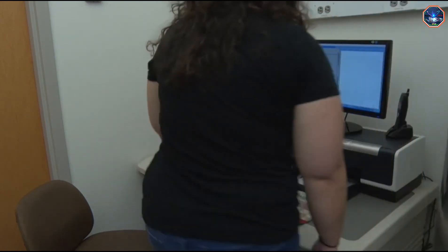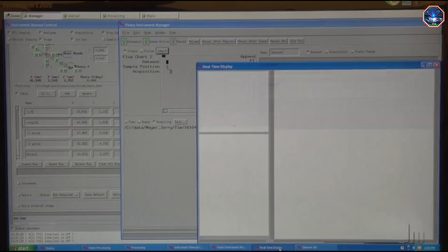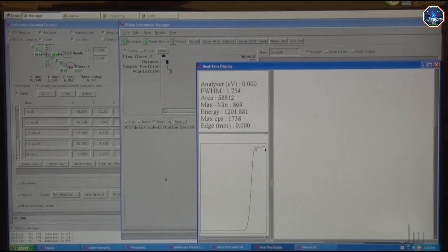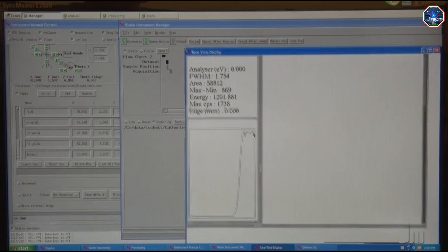Once this is done, I can start collecting data. It will take anywhere between 15 minutes to an hour per sample, depending on how many elements I'm interested in looking at and how concentrated they are in the sample.